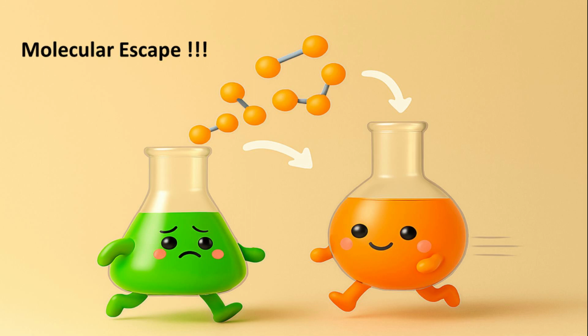Extraction is essentially the story of molecular escape. Molecules are not randomly scattered, they are selective about where they want to live. Each molecule chooses the solvent where it feels most at home. This preference is what allows us to separate and purify compounds. For caffeine, the journey is dramatic. Given the option, it leaves water and bolts for dichloromethane, an organic solvent. This choice, invisible to the naked eye, drives the entire process of separation.